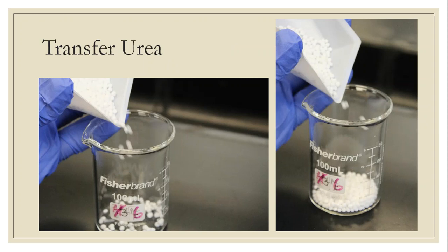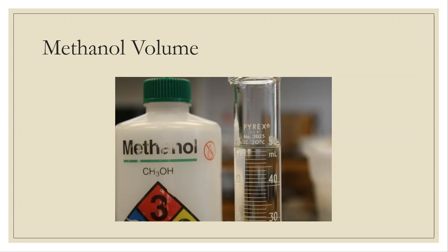So I'm going to transfer all of that urea over to a beaker. I'm going to have to make a solution with this urea, and it's going to tell me to add methanol to it. So I've transferred all of the urea over to the beaker. I'm then going to go back to my stock methanol, and the lab tells me to measure out 50 milliliters. So that's what you're seeing here in the picture. Here's the 50 milliliter mark.